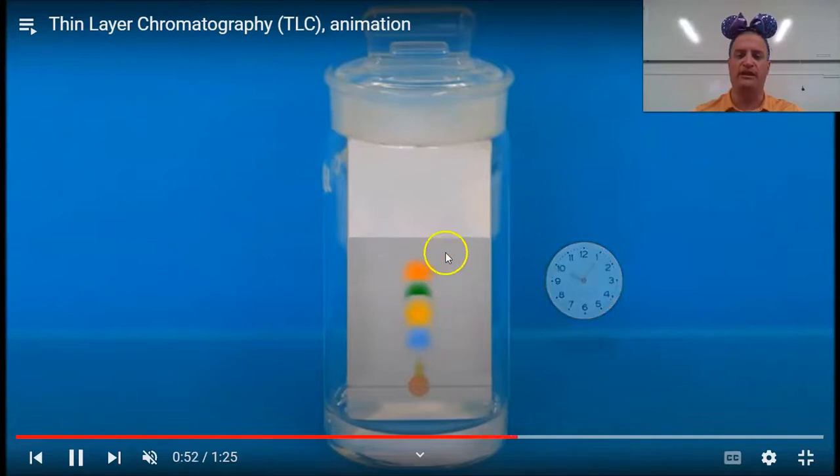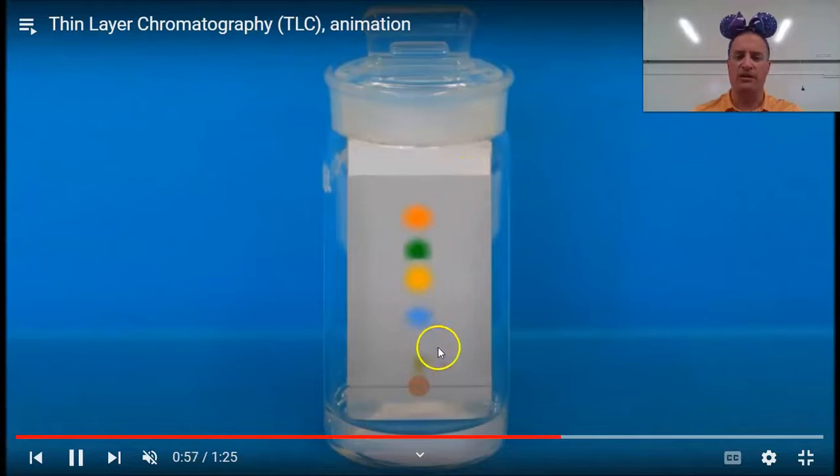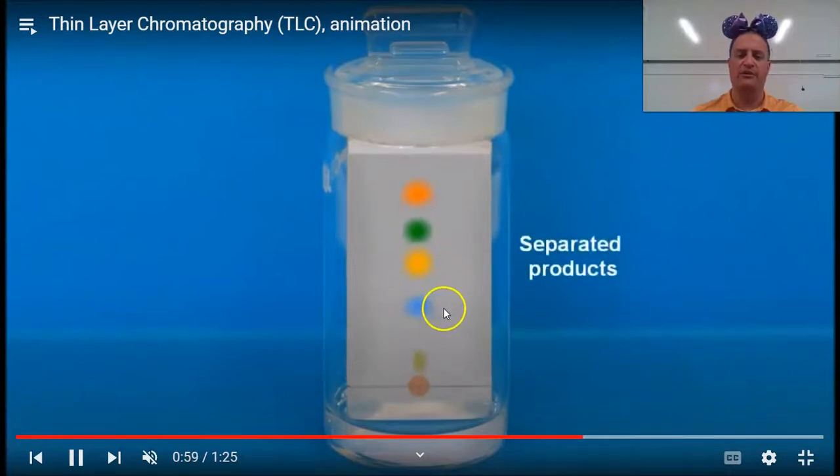The stationary phase, the paper, does have some added effect in separating them out, but this really does show a very clear delineation between our 5 different products based upon what we can see. So some of the original remains because it gets embedded in the paper, but we're able to see this separation to see that there's 5 different components, and that the one that has the strongest attraction to the mobile phase would be found here. The lowest level of attraction is found here.